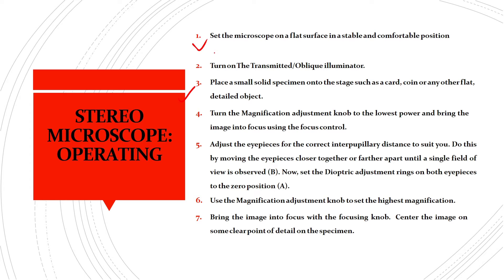Place a small solid specimen onto the stage, such as a card, coin, or any flat detailed object, and fix it using the stage clips. Then turn the magnification adjustment knob to the lowest power and bring the image into focus using the focus control. After that, adjust the eyepieces for the correct interpupillary distance to suit your eyes.